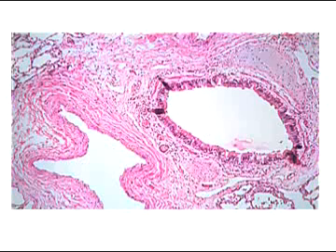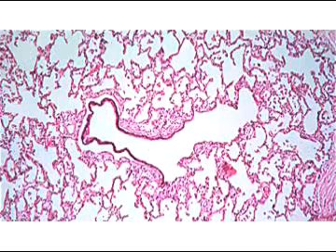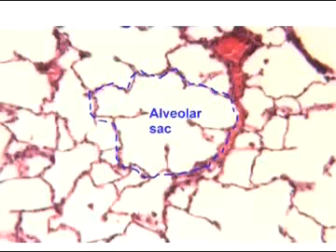On the right is a bronchus, and there's a single plate of hyaline cartilage on the upper right, and you can see, even though it's a little bit blurry, that definitely is a hyaline cartilage plate, so that would make that a bronchus. Here's another bronchiole. You can see really nicely the dark contrast of the cuboidal epithelium with the surrounding simple squamous. So it's a really nice slice because it goes right into an alveolar duct. You can see sacs there at the very end of that structure.